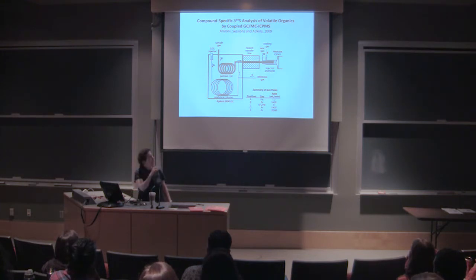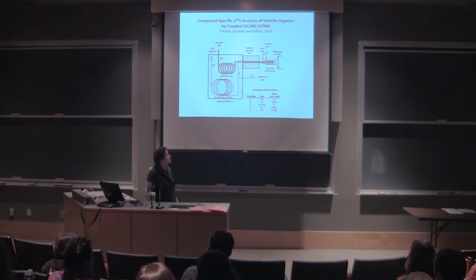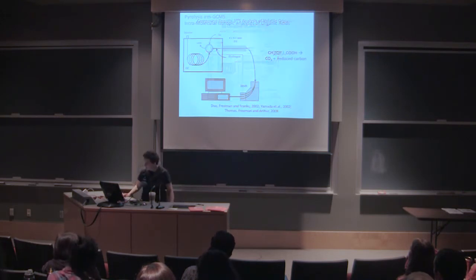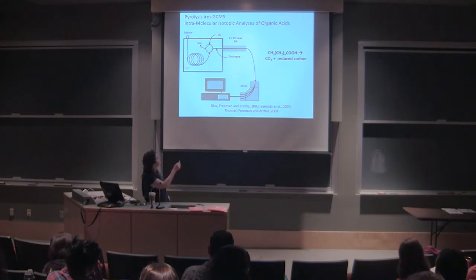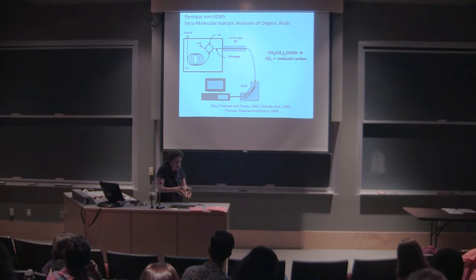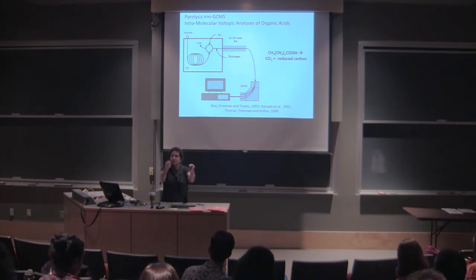Okay, so that's an example of this expanding toolbox of compound-specific work. Some work that we have done, and that has been picked up and continued by some others, is the idea that you can pyrolyze a molecule as it comes out of your GC and break it.